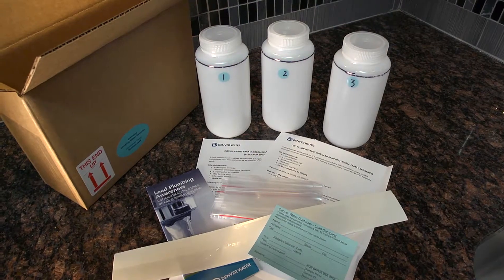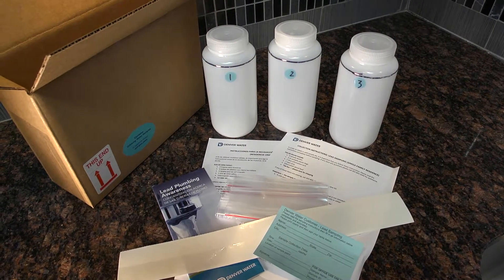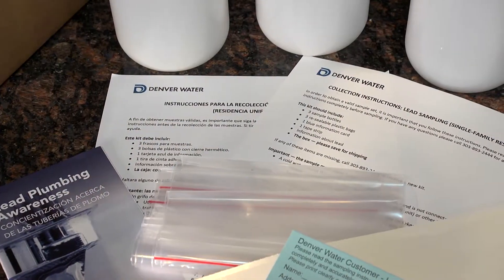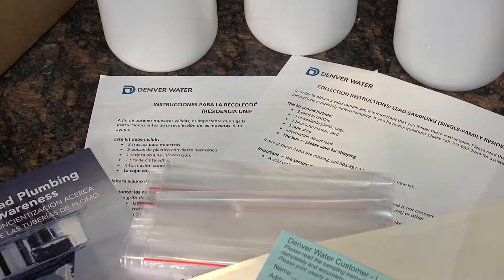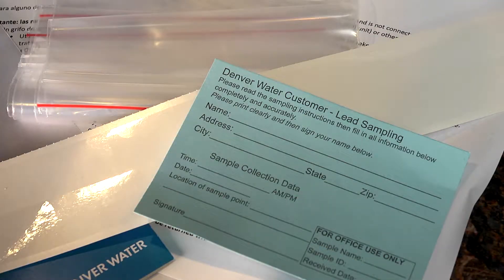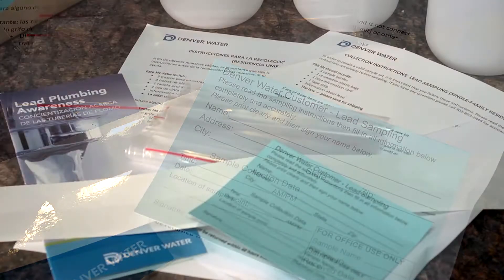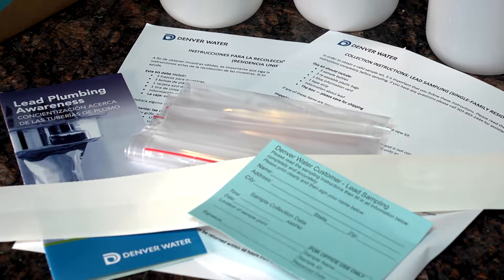The lead sampling kit includes three sample bottles, three resealable plastic bags, an instruction sheet, a blue information card, a strip of tape, information about lead plumbing, and a box for return shipping.